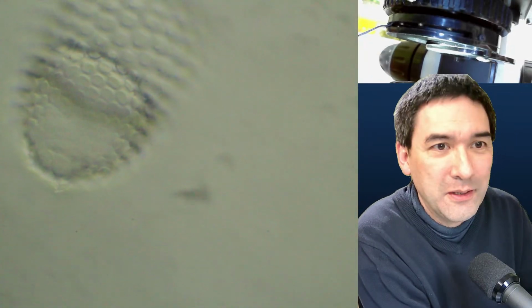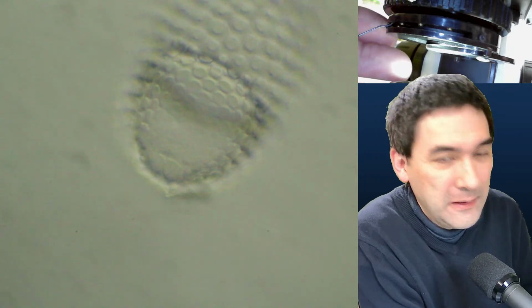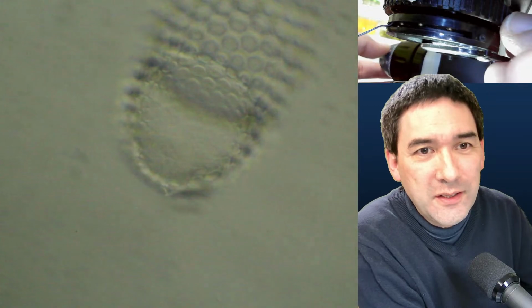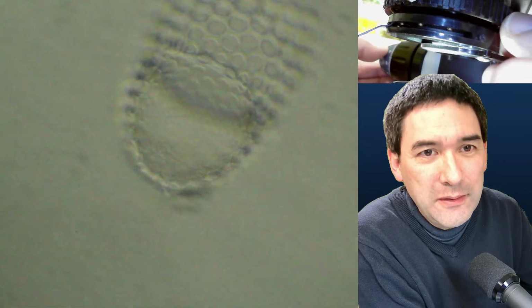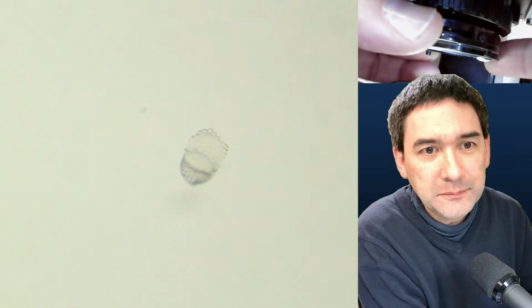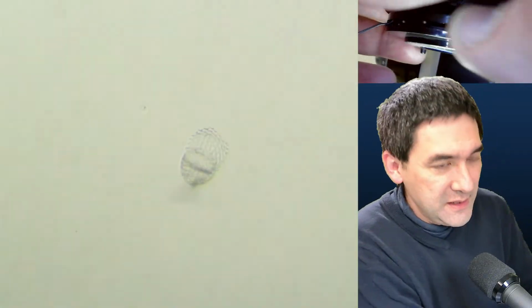Okay, so that's now the 40 times. Of course, the depth of field is very low. So it's no comparison. There's another thing that I want to show you, and that is one of those blue ones that I'd like to put in here. Here I have to open it again. There is again the problem: the camera is not able to capture. Where is the lever?